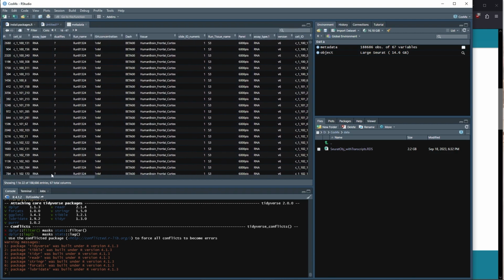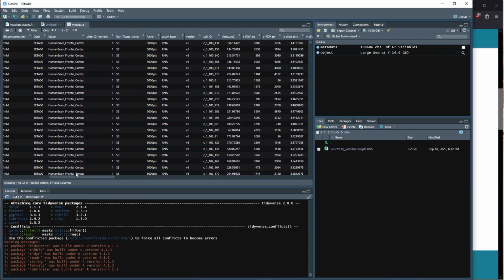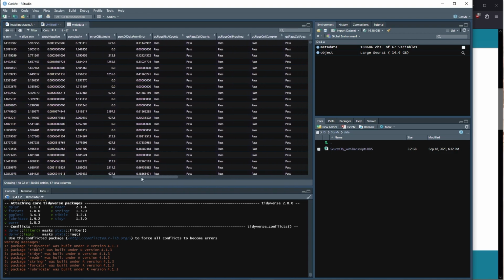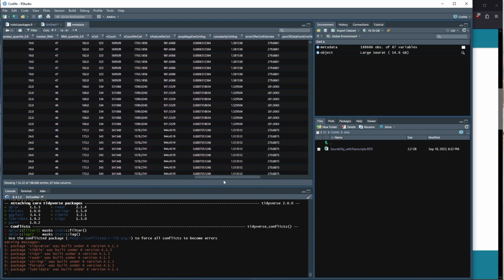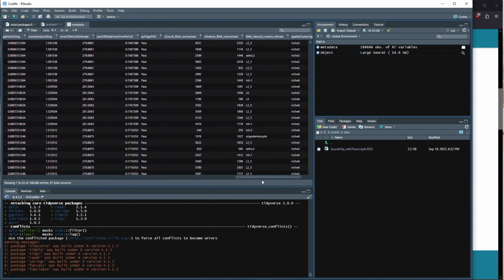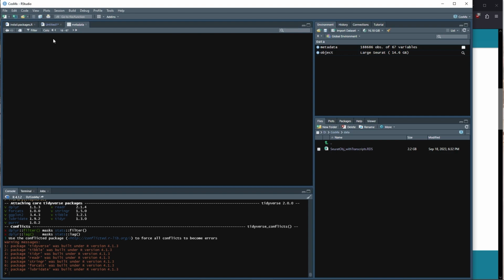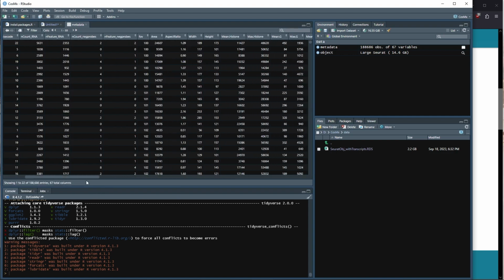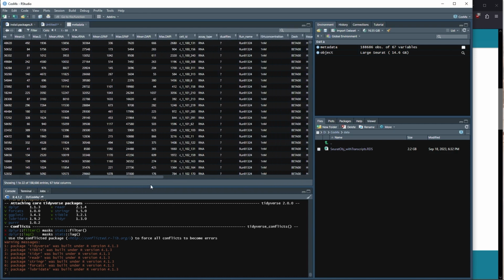It's not called slide. I probably passed it. Well, let's go back here. So there's our field of view area, so on and so forth.